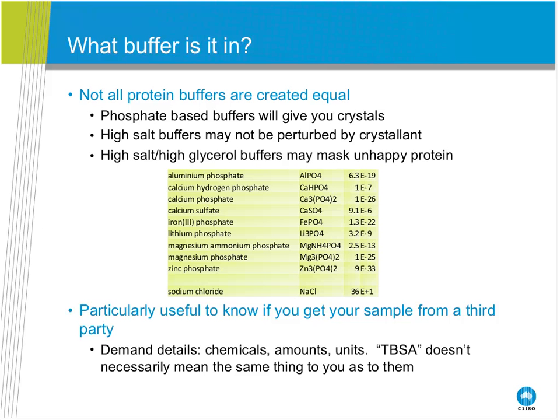What you have is protein which is being shocked into suspension by all the other stuff in that solution. So one hint is if you need to have a very concentrated buffer to keep your protein in solution, you need to, even before you start crystallization, go back and work on your protein to make that a happier and more stable protein.